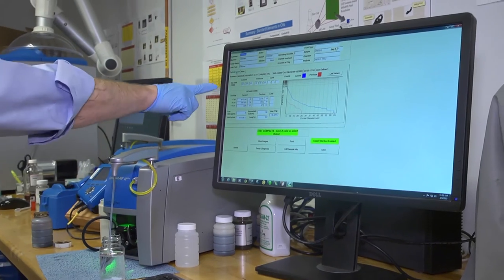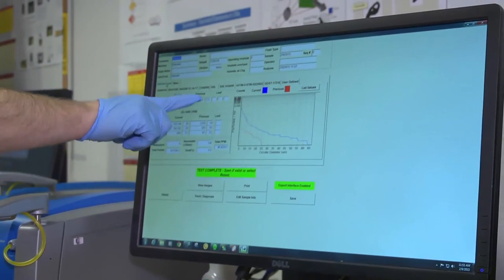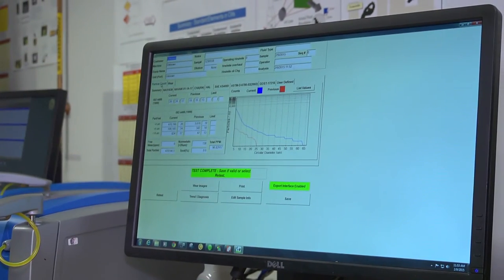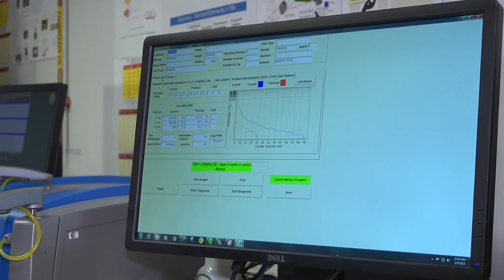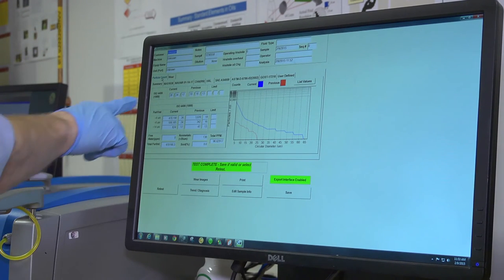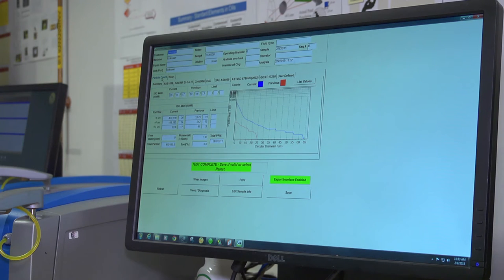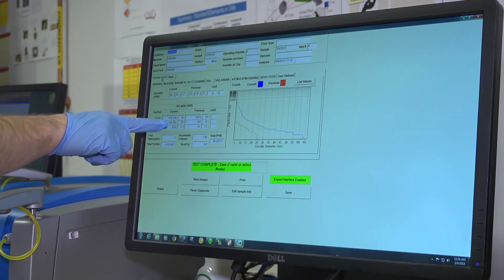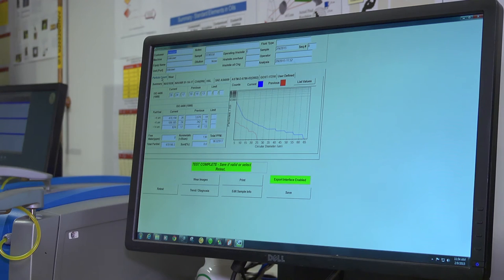What we have here on the basic tab is the particle count itself. Here, the ISO codes are summarized. There's a previous ISO code. If one was to run it as an asset, it would then compare it to the previous ISO code. But we just ran it as a straight sample, so that's the current measurement. So the ISO codes, particles greater than 4, greater than 6, greater than 14 microns. You can see that that's a fairly dirty sample with 470,000 particles greater than 4 microns with an ISO code of 26, 24, and 17.